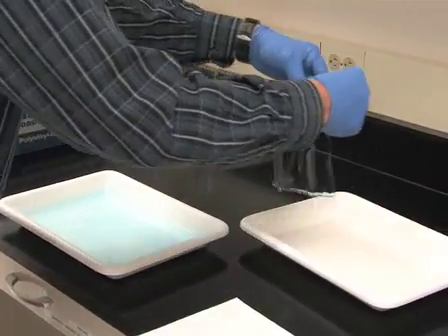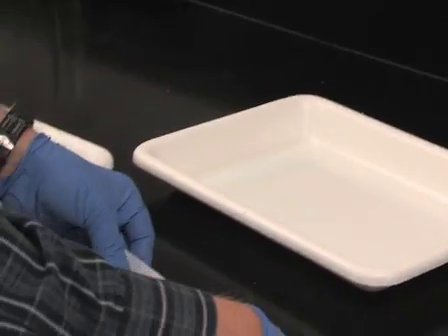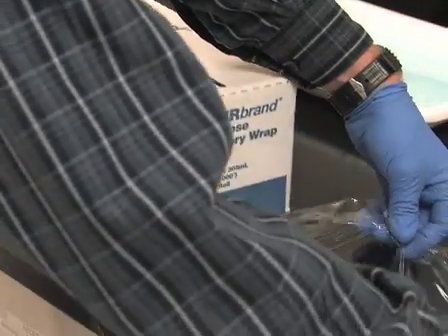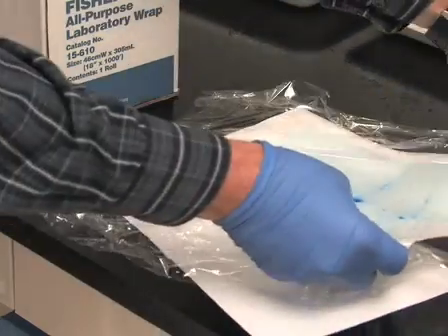The gel may also be dried at this stage to maintain a permanent gel record. To do this, place the gel on 2 sheets of Whatman 3mm filter paper and cover the top with plastic wrap. Then dry in a conventional gel dryer for 1-2 hours at about 80 degrees Celsius.